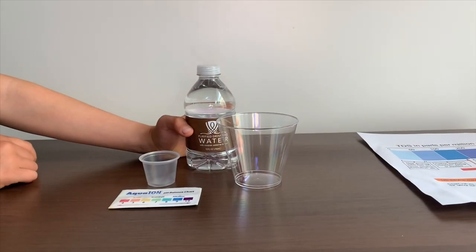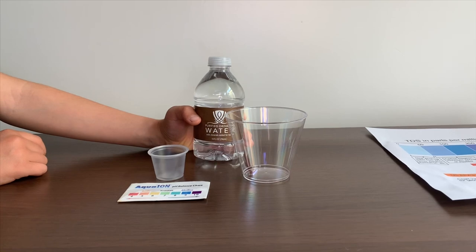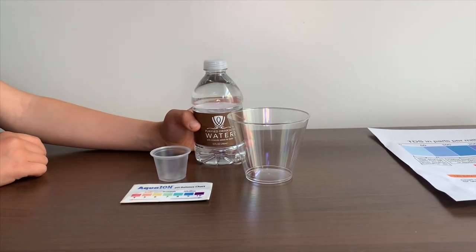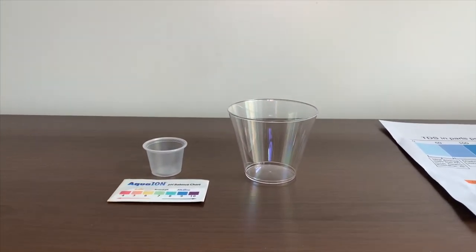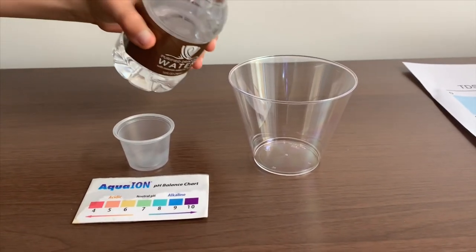This is a Wynn Hotel Las Vegas purified drinking water, with minerals added for taste. Let's test the pH and TDS levels. Let's pour some water in.